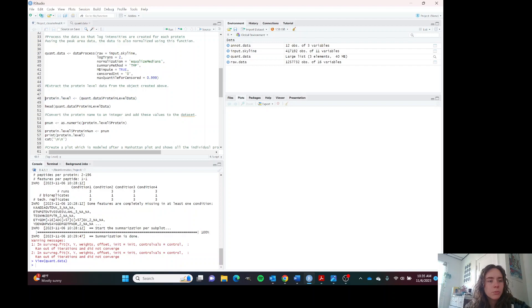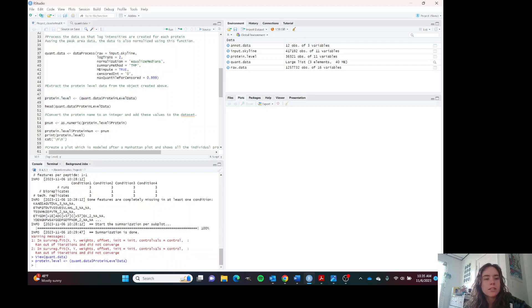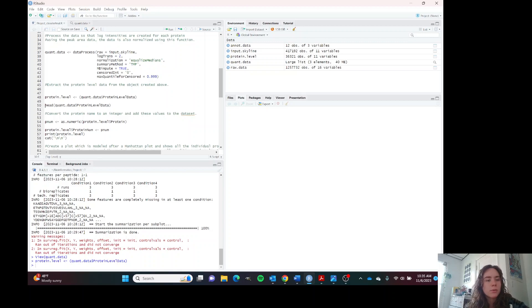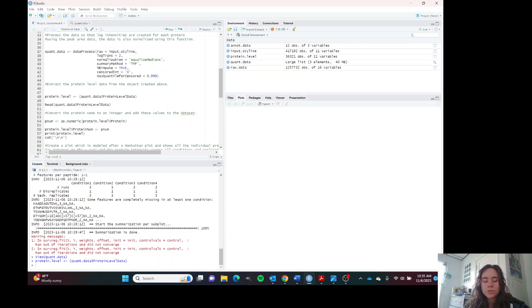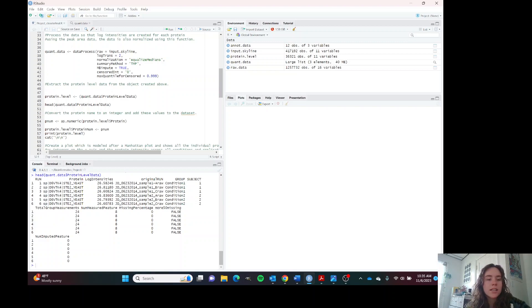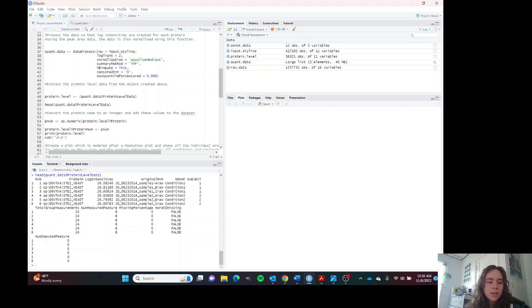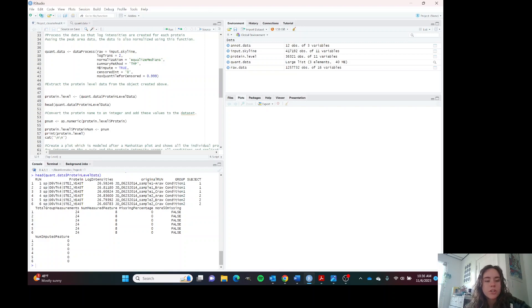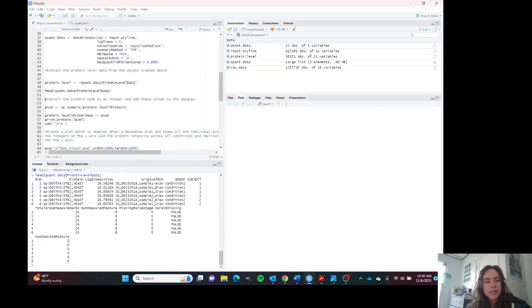I'm going to run this line. This takes the protein level data from the quant data object and puts it into a variable. We're just going to take a look at what that looks like. We have the protein name, the log intensity of each protein, and then the conditions and some other information that isn't very useful to us right now.